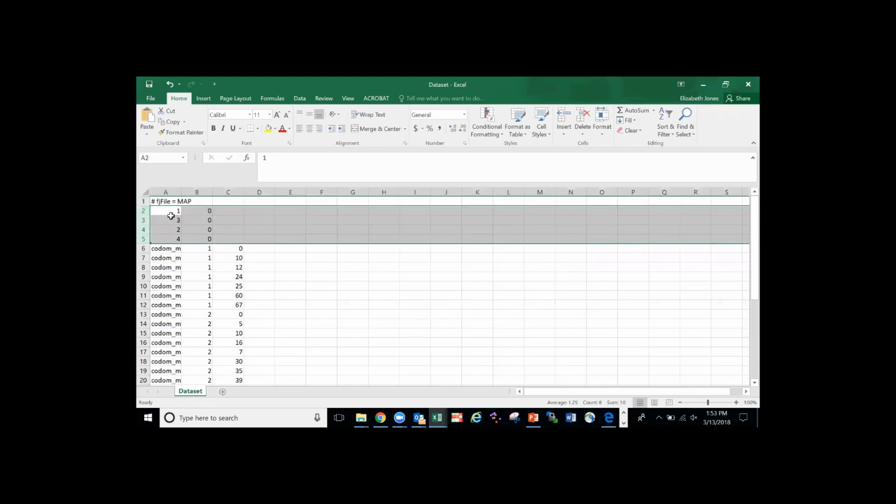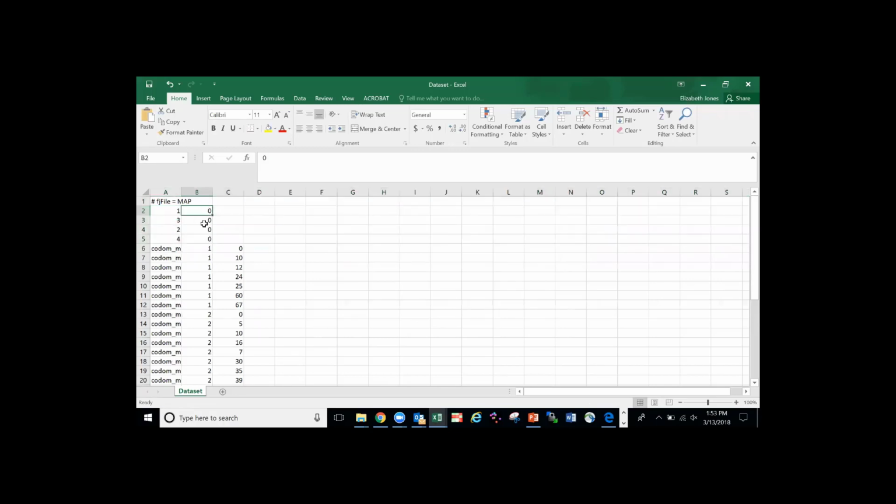You can specify what the ends of the chromosomes are. I've got four different chromosomes here, and I've got no information on what the end position of the chromosomes is. The reason why you might want to know the end of the chromosome is if you're doing MABC and you want to know what the linkage drag is for the QTL compared to the rest of the chromosome.